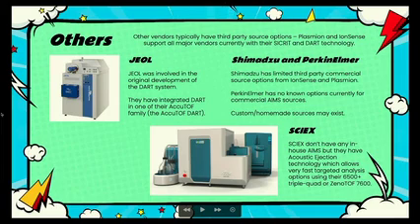Others, so I apologize to Japanese friends who are more familiar with JEOL than I am. JEOL don't offer mass spectrometers in the UK, European market, so my exposure to them is a little bit limited. Chip Cody and the guys that developed the DART system originally worked with JEOL, and JEOL did have, I think it's still listed for sale, the AccuTOF DART. So it's again, a little bit more integrated, but it's not as fully integrated as the Bruker DART system.